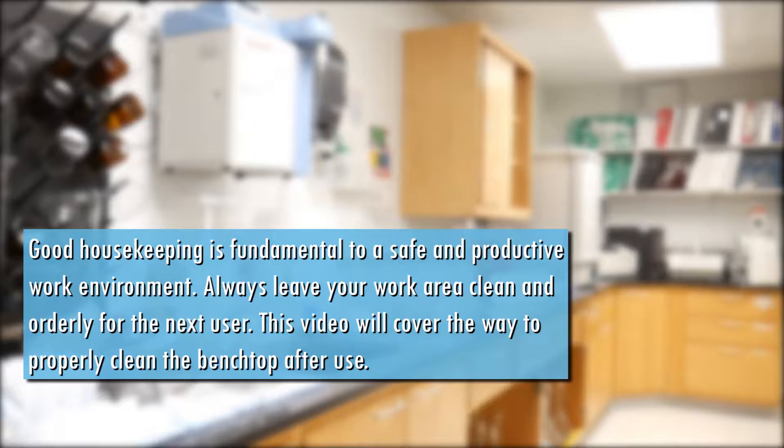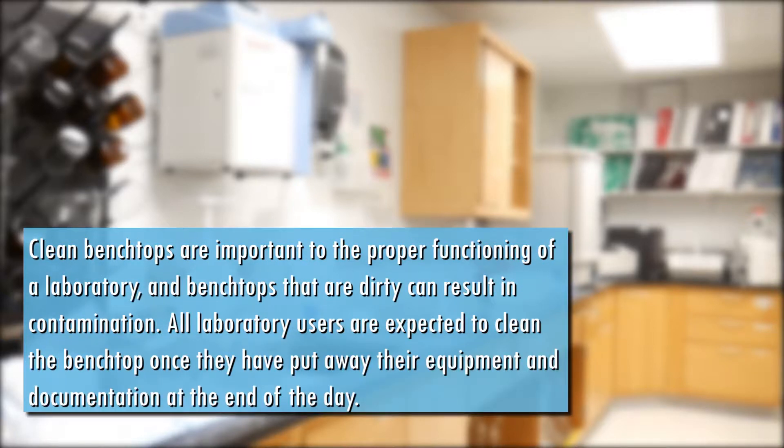Good housekeeping is fundamental to a safe and productive work environment. Always leave your work area clean and orderly for the next user. This video will cover the way to properly clean the benchtop after use. Clean benchtops are important to the proper functioning of a laboratory, and benchtops that are dirty can result in contamination.